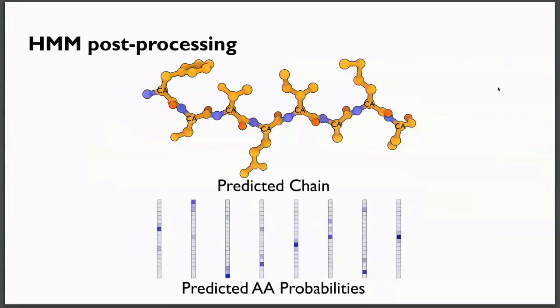We have a probability associated to each residue based on what residue type we expect it to be, but how do we actually know what it is specifically? You could just take the highest probability per prediction for each one of them. But you're losing information here because you are also given access to the sequence. So what you want to do is look at the sequence and see what is the best match to the sequence you have for each chain, and use that information to determine the sequence for each residue.